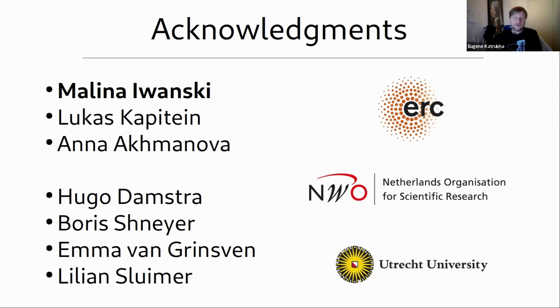And now there is also this 3D plugin, so while Zen is busy acquiring something, you can very quickly look at the data in 3D and maybe make a movie and show it at the next meeting, which is not always possible if you have only one Zen license. Then you use it for acquisition, and you also need to book some slots to do the deskewing, and then maybe you can do only some movies after that. So that actually helps in our workflow for Lattice Lightsheet.